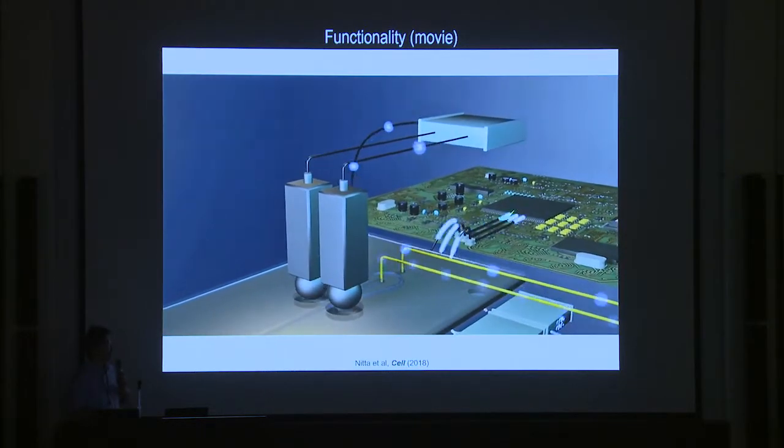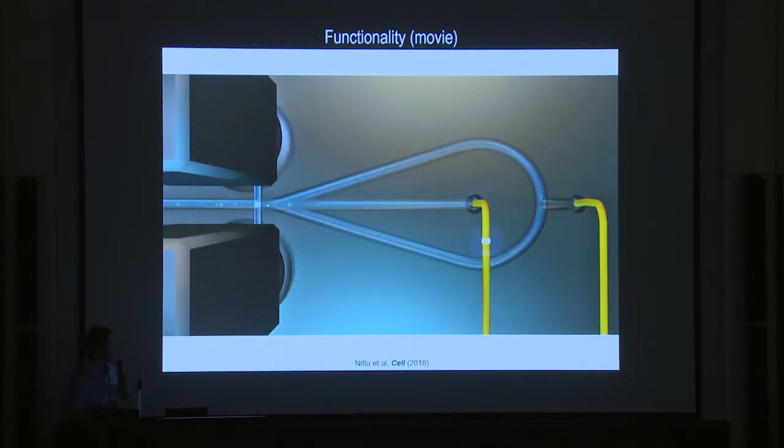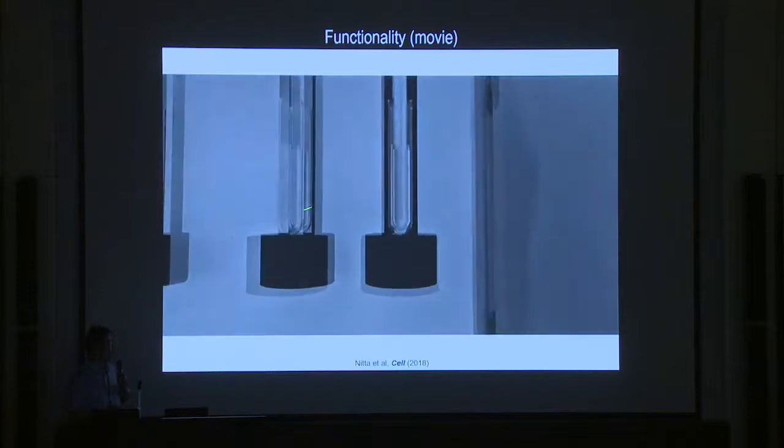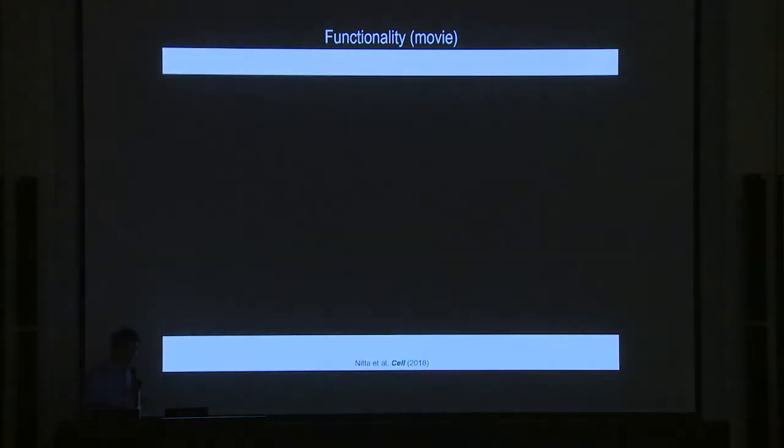And then a decision signal is sent to the sorter module, and when the target cells come, we pick the cells from the mainstream, and then we eventually get sorted and unsorted containers.